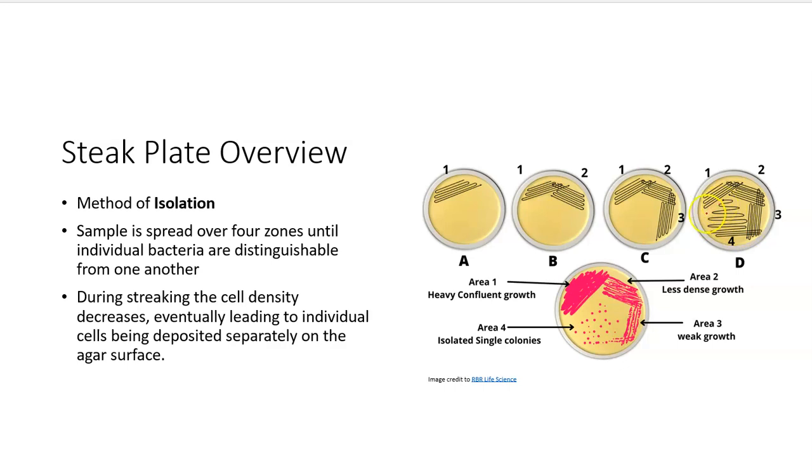And what you're doing is you're putting less and less bacteria in each quadrant so that those bacteria have the space to grow in isolated regions and mature into the structures that we call colonies. So once we incubate the streak plate, we fully expect that typically quadrants 1 and 2, because they still have a high concentration of bacteria, we don't expect that they're going to really have isolated colonies. We expect that those quadrants have so much bacterial growth that the colonies kind of merge together in that big blob I was kind of referring to.